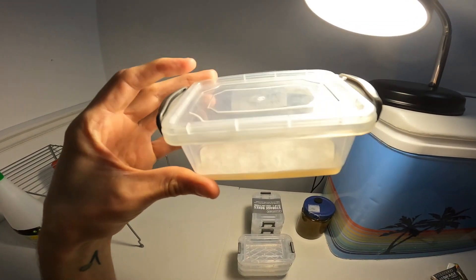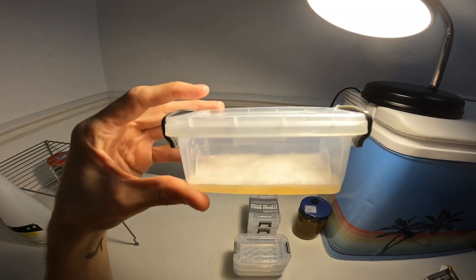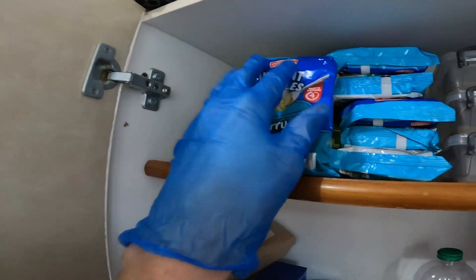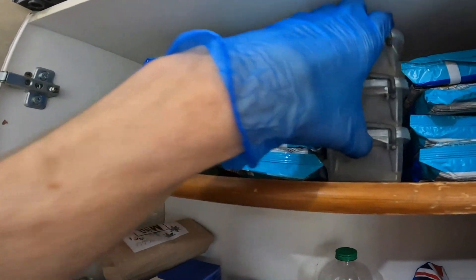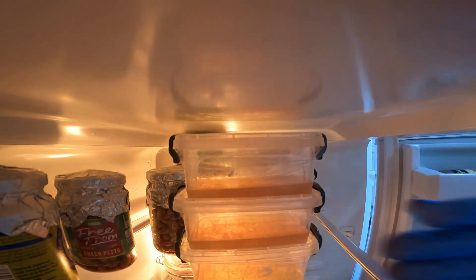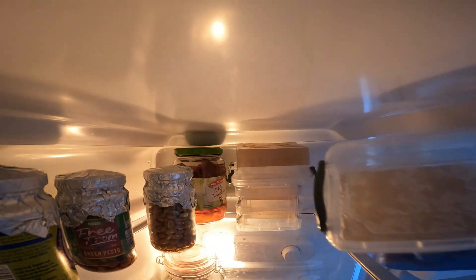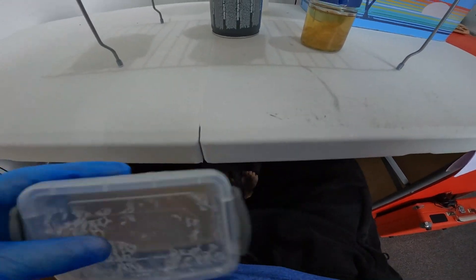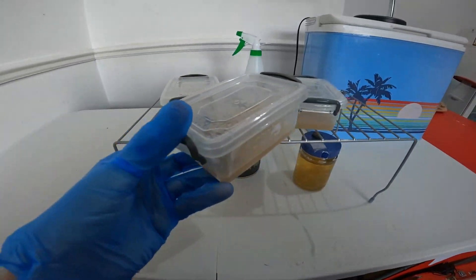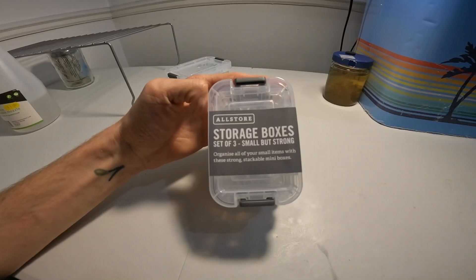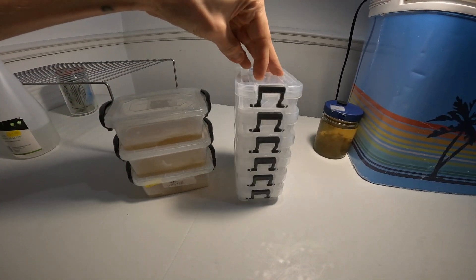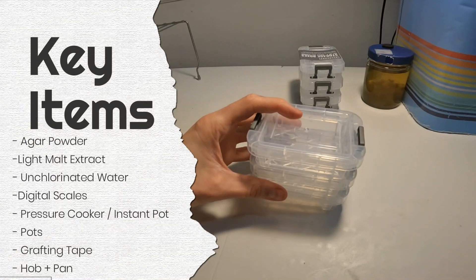I've recently been experimenting with these reusable agar pots and they are really good, but the issue is they're just so cumbersome and they seem to be taking up all the space in my flat. I did a bit of shopping around and came across these that look absolutely perfect as they're half the height of the original ones.